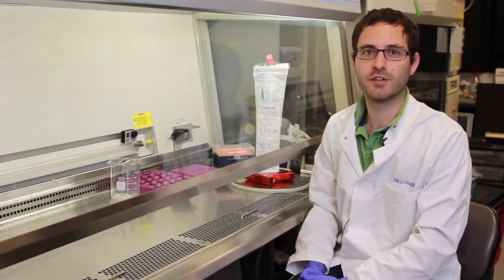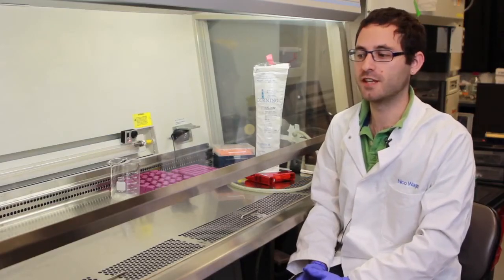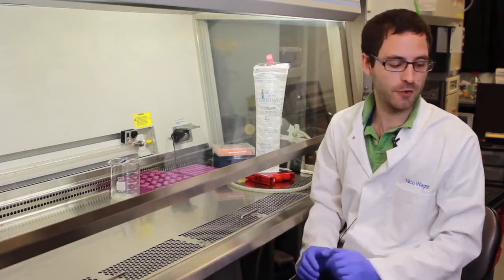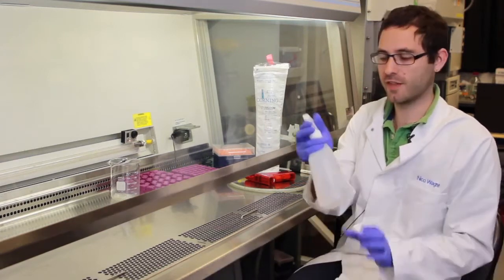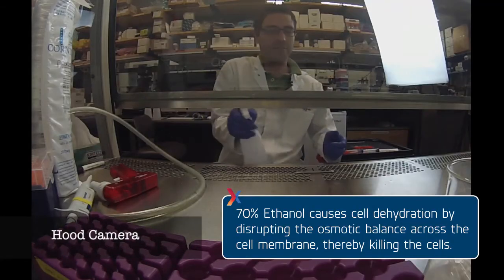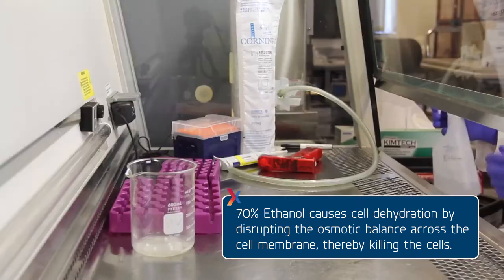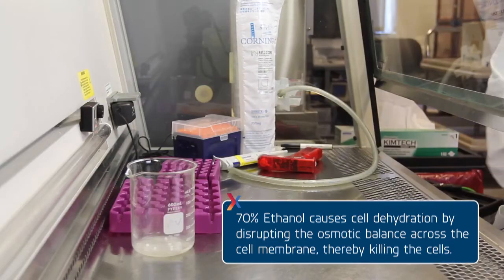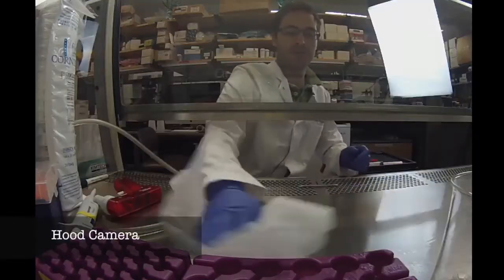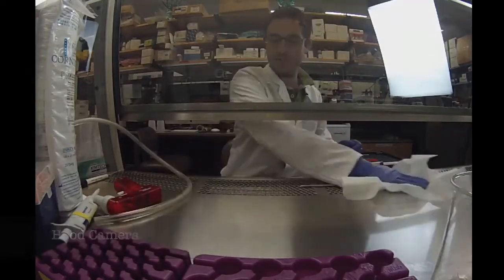For working with tissue culture, one of the most important things is to keep a sterile working environment. So before touching anything inside the hood, it's important to spray everything down with ethanol. We use 70% ethanol and I'm just going to quickly spray everything down in here that I'll be using. I'm going to wipe it up to make sure no residual ethanol gets in my way.